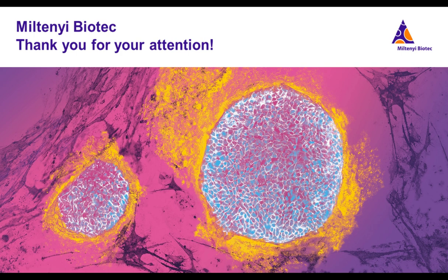Great, thank you. Can we identify intracellular markers? Yes. An important point to mention: if we're analyzing tissue slices, they are fixed, so the fixation method is also generating holes in the membrane.